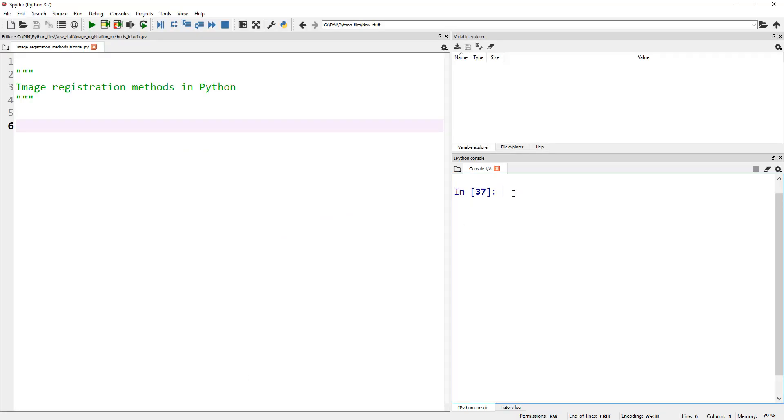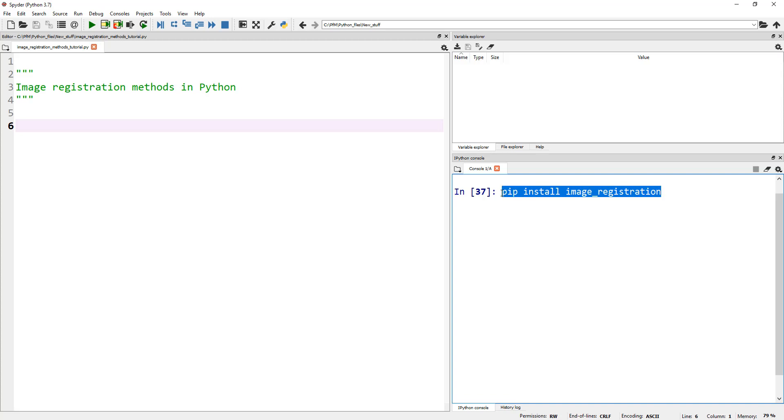If you'd like to get this package, go ahead and do pip install image_registration. Once you have this package installed, I'll show you these two lines on how to write your registration - two lines of code for your registration.